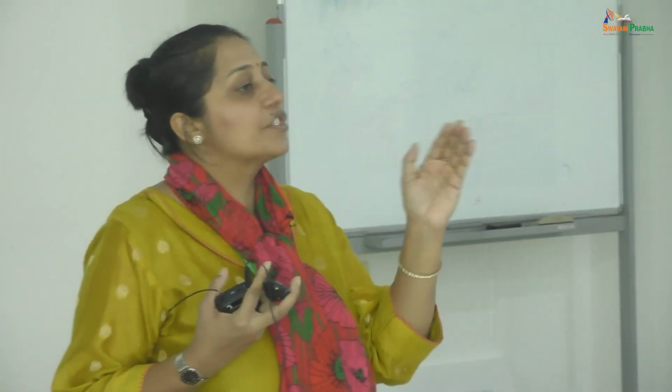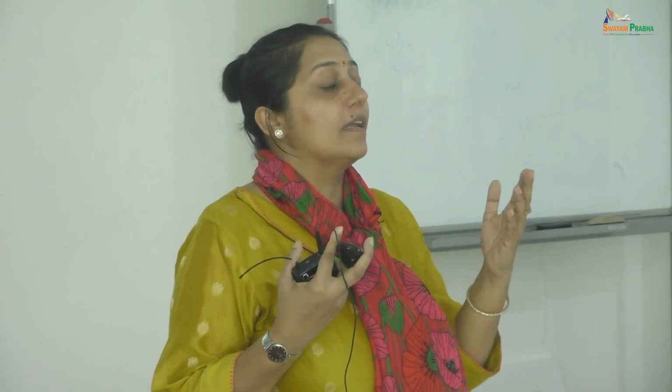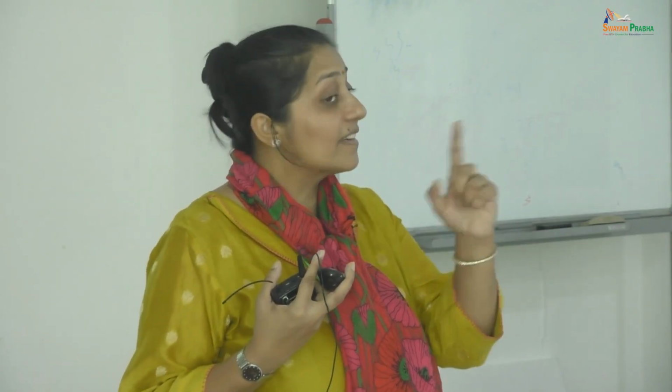OTR is what? Oxygen transport rate. If there is higher gradient, what is the driving force for higher oxygen transfer? Concentration gradient. That is the driving force. Oxygen present in the air is in much higher concentrations than what it was in your liquid media. Now the gradient is more and therefore more oxygen transport rate.